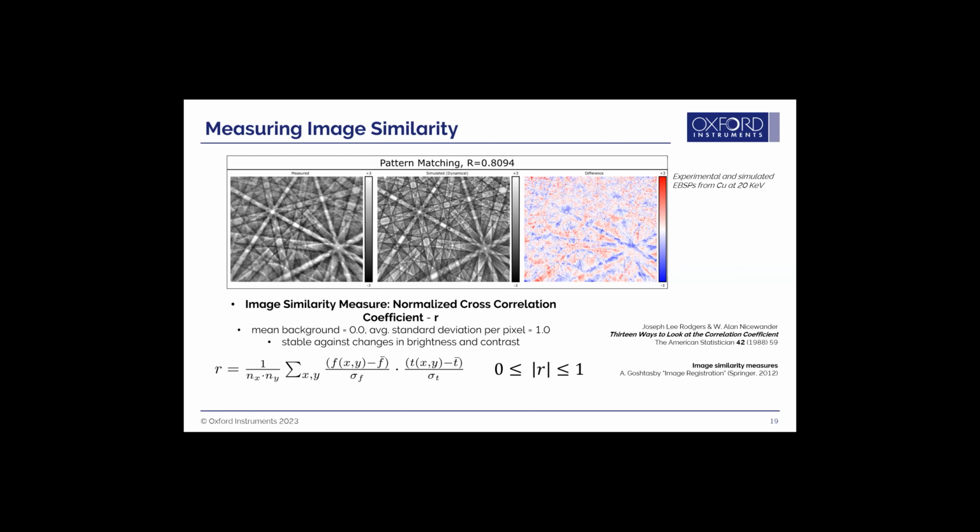But we're effectively building an R value that's somewhere between 0 and 1. Kind of the numbers that we're looking at right now, and this is still up for debate, but something around 0.2 and above might be acceptable. Below about that, it's kind of questionable. In this case, we're at 0.8. You can see we already had a good pattern to begin with, so it's not terribly staggering that we matched it at a very, very high cross correlation factor.